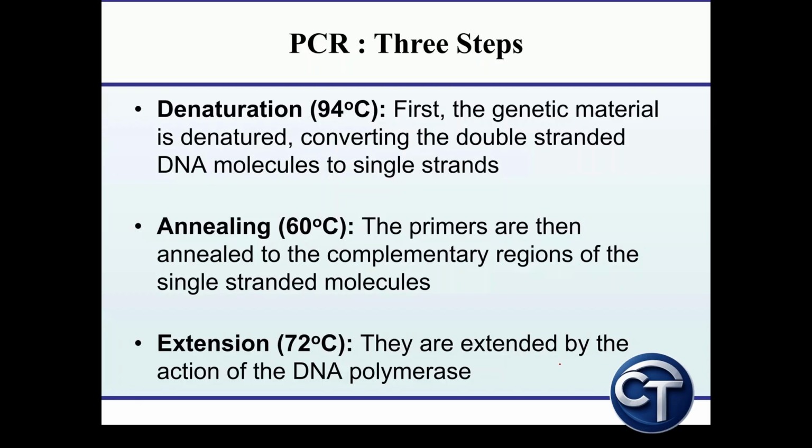Otherwise, these steps may be pre-denaturation, then denaturation, annealing, extension, final extension, and then storage. Denaturation occurs at 94 degrees, though this temperature can vary from 92 to 98 degrees. Denaturation is important because it converts double-stranded DNA into single-stranded DNA, or in other words, it separates both strands of DNA and allows the primers to find their position and attach there during the annealing step, where the temperature comes down to around 50 to 60 degrees. Polymerization starts at 72 degrees centigrade, where nucleotides are added to the growing strand of DNA.